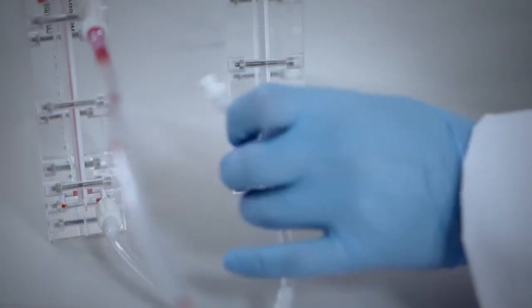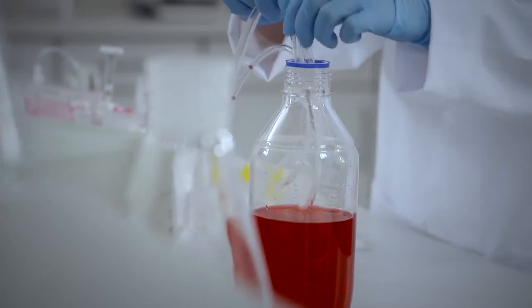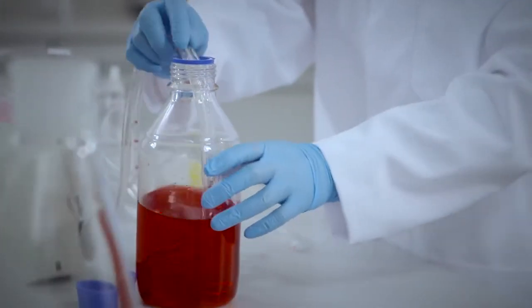Then connect the inlet ports of the VivaFlow 200 cassettes using the branches of the Y connector. At this point, place both outlet tubes and the inlet tube together at the sample reservoir.